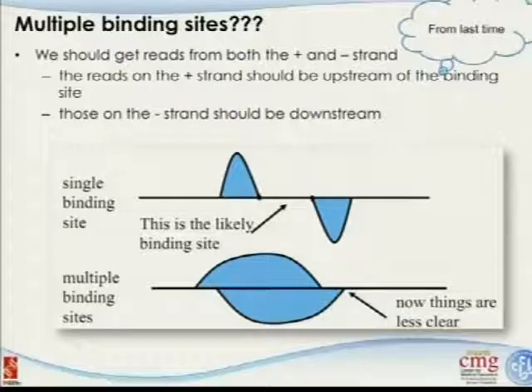We also mentioned that in this whole thing we are assuming that this binding site is one independent binding site, with no surrounding binding sites of the same protein. That's why we always assume this type of two peaks, one on each strand. But sometimes, if multiple binding sites happen, there's a possibility that you will see broader peaks if there are multiple binding sites in this region.